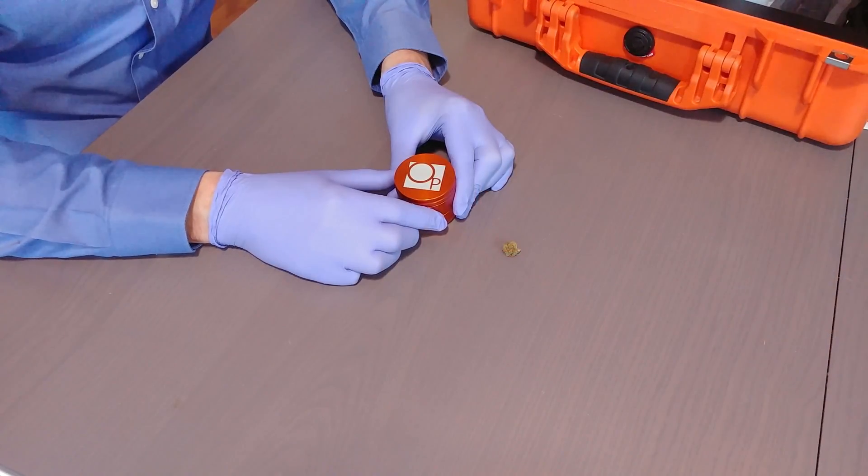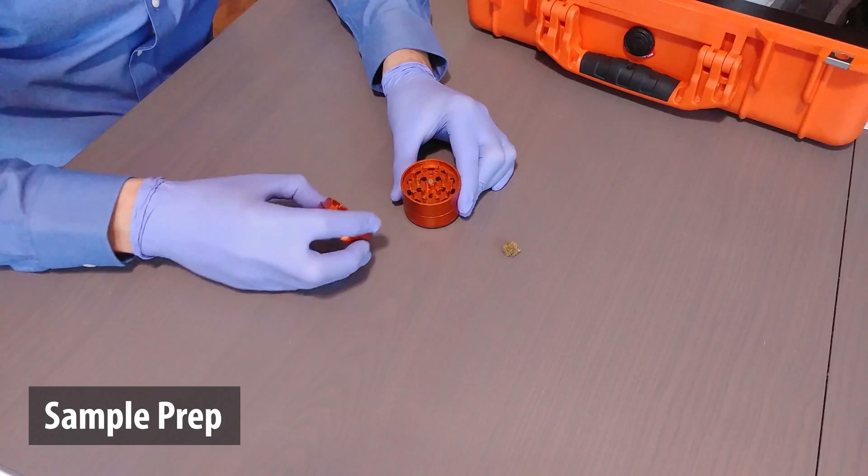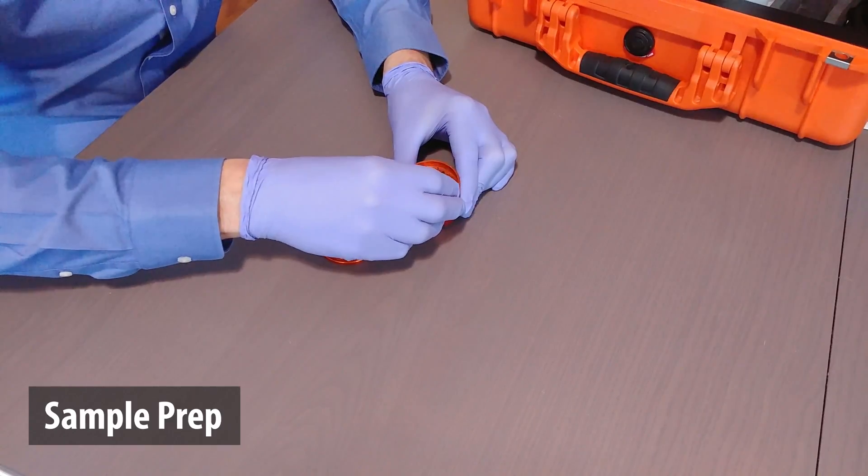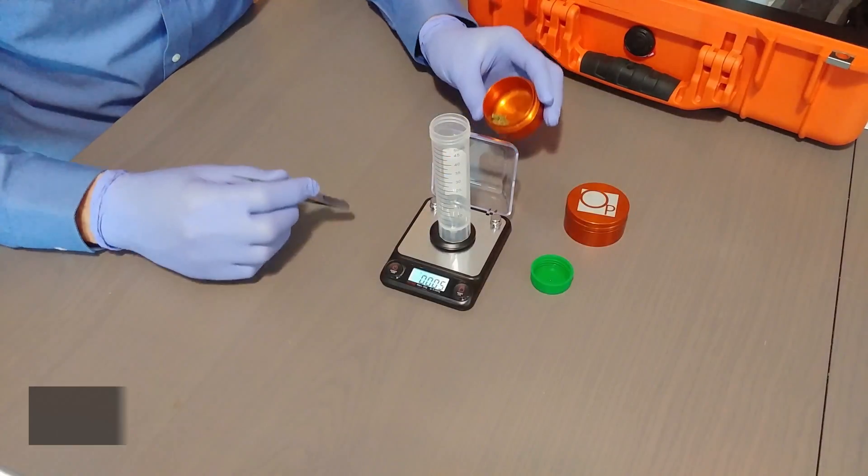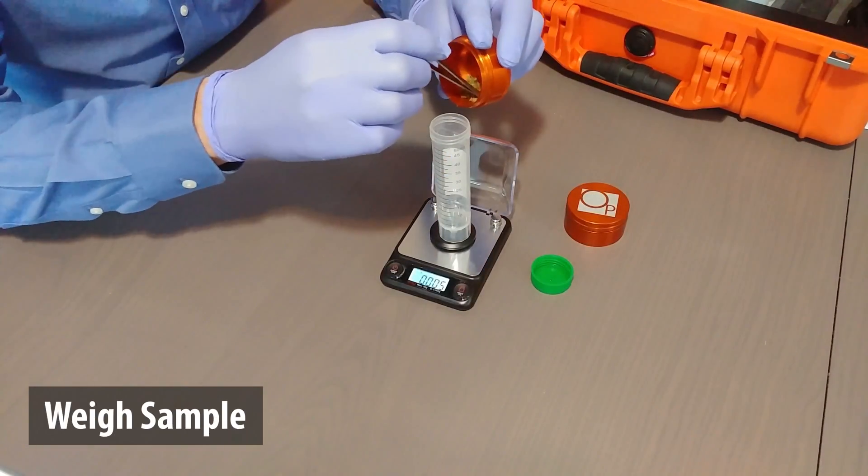The first step is to prepare your sample by grinding it up. The next step is to weigh out the appropriate amount of sample.